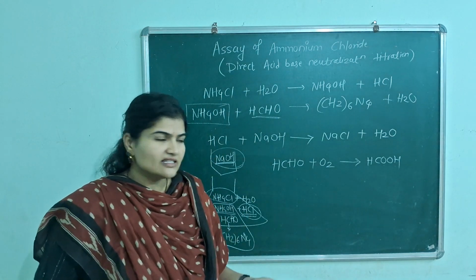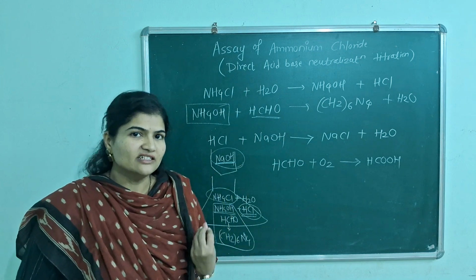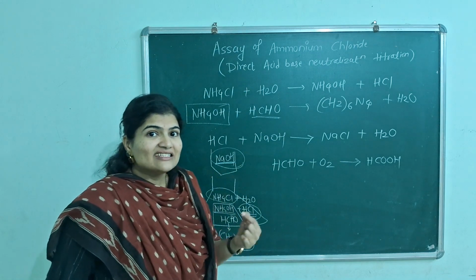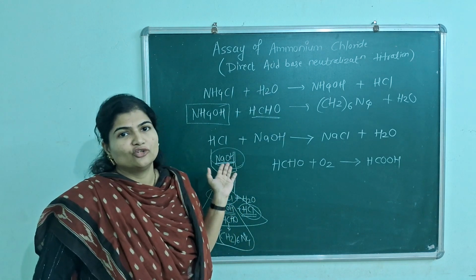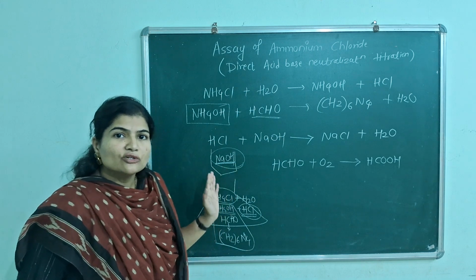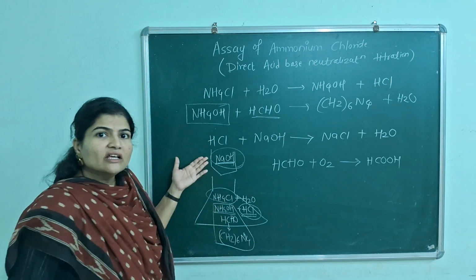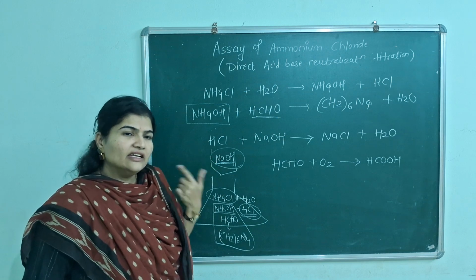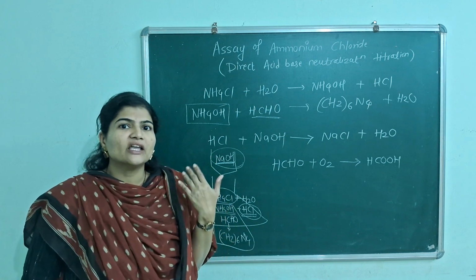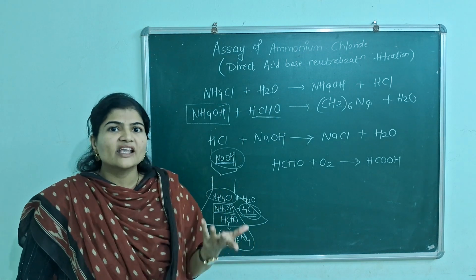Now in either case, whether it is oxidized to give formic acid or it contains some acidic impurities, that acid content in formaldehyde can interfere with your titration, right? Because if it adds its own acidity to the solution, then we'll need more NaOH than required and it will give us a falsely elevated reading. So our titration error can worsen.